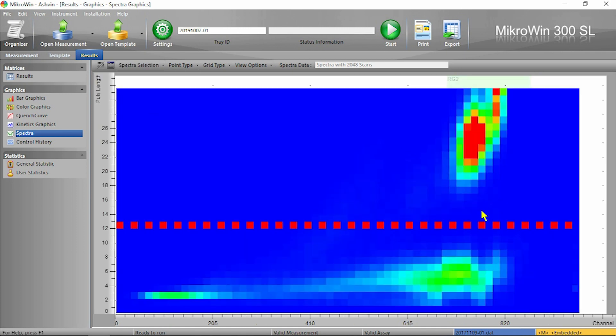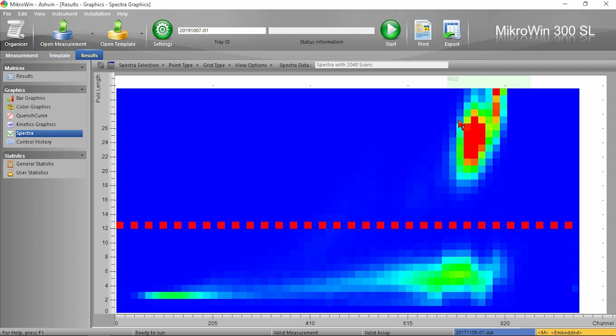As you can see, at the bottom is the beta peak and at the top is the alpha peak. The red dotted line is the pulse length indicator. This separates the alphas and betas.